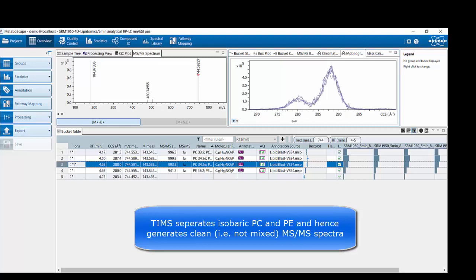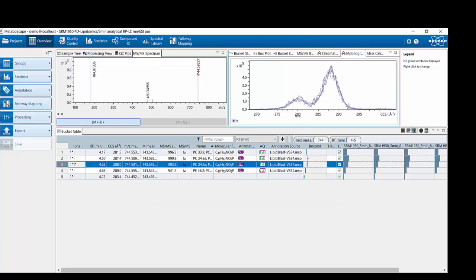The tiny peak with a CCS value of 280 corresponds to our PE lipid. Its intensity is lower compared to the PC, which has a CCS value of 288.